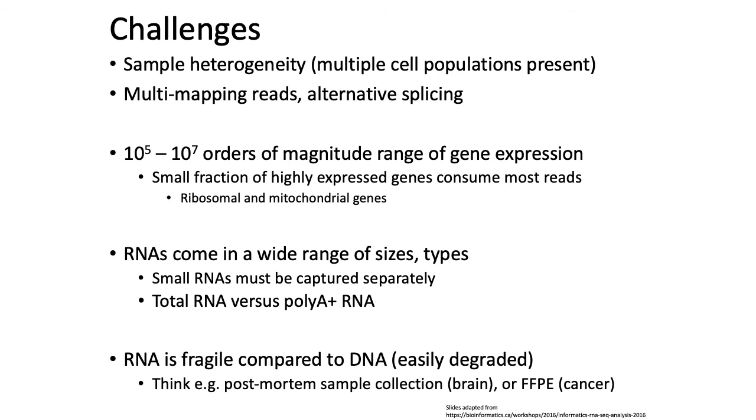And finally, as I mentioned with the RNA integrity slide, it's typically hard to get really high quality RNA across many samples. When you're comparing transcripts and gene expression patterns across multiple samples that you might collect, RNA integrity and diversity, library complexity essentially, can change between samples, and this can affect how accurate your comparisons between samples are.